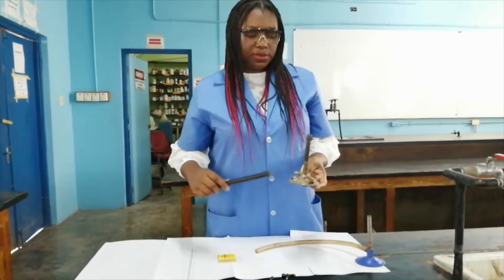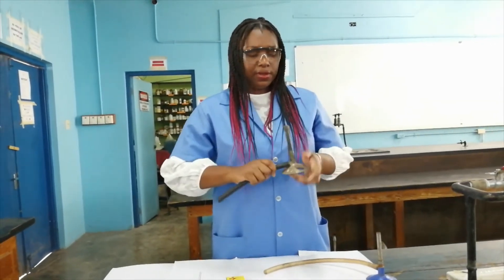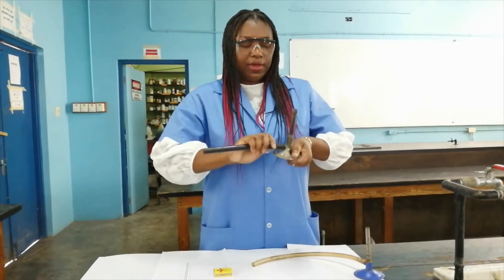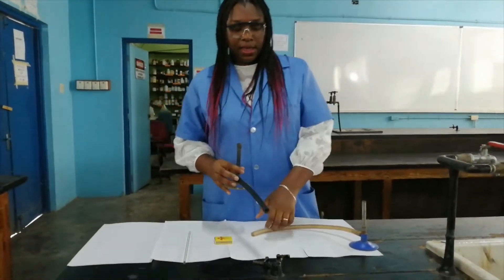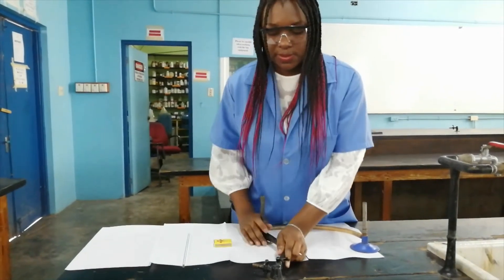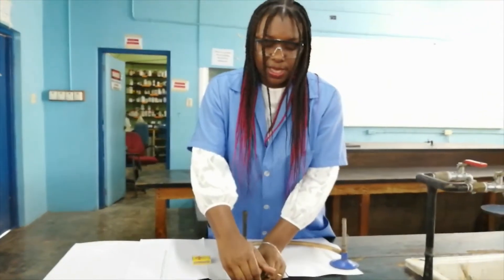I am now going to attach the gas hose securely to the Bunsen burner. We have to ensure that it is securely attached because we do not want any gas leaks. I am now going to connect it to the outlet, so again we securely attach it.